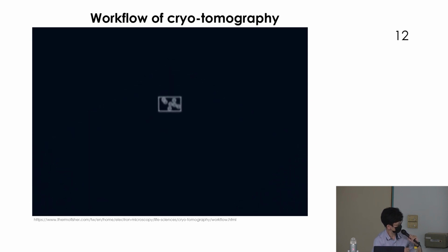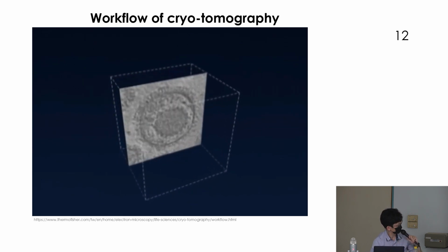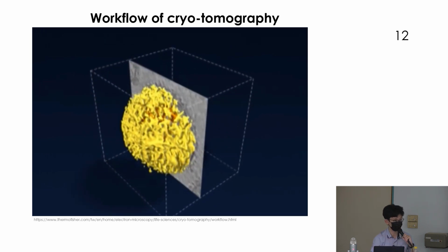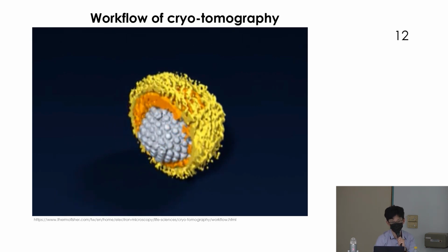And this 3D volume is called a tomogram. So from this tomogram, we'll be able to extract information and build a 3D reconstruction. That's the basic workflow of cryotomography.